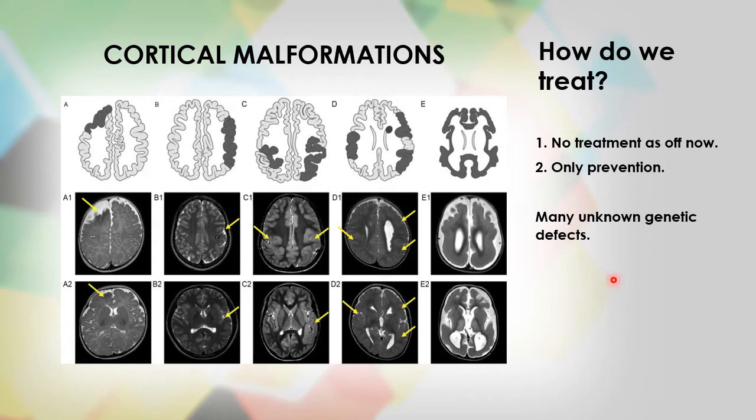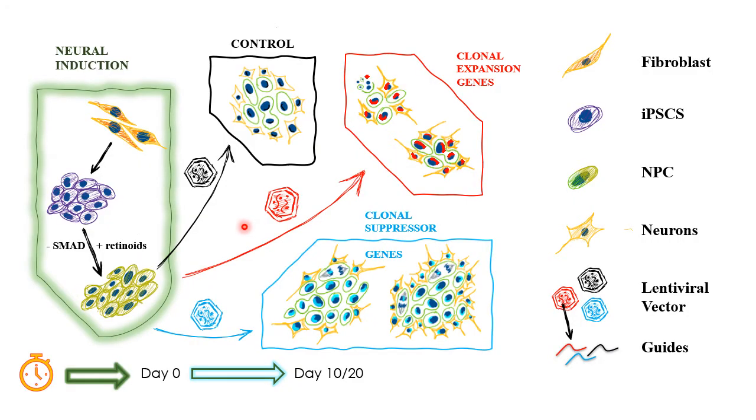But with emergence of in vitro systems for cortical development like iPSC-derived human neural progenitors and CRISPR technology, now we can conduct genome-wide CRISPR knockout screens to identify the regulating genes. Livesey Group conducted such screens on iPSC-derived human neural progenitor cells. This is how the screen works.